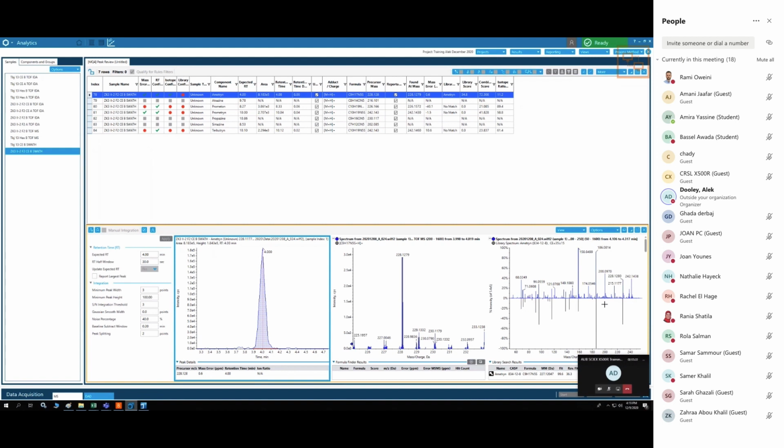That could be good. Anyway, we have plenty of data here, so if you're not comfortable to do that, it's okay. We can still process this data tomorrow through different ways of processing. But it would be good to have stable retention times for the unknown analysis. That's the key point for the unknown. So do you feel comfortable to do that? I think it will take you about 10 or 15 minutes to do the purge, and then you can just change the date and submit the samples again. I can help you now with the batch. Does that sound like a good plan for tonight?